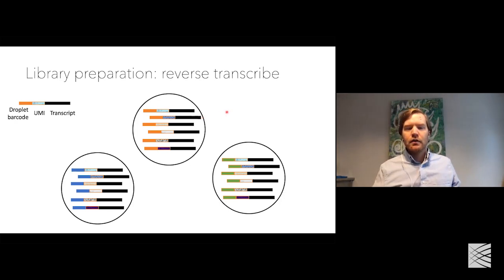And there's one more question. Thank you. It's also on this general theme. The question is, UMIs will by definition linearly increase with sequencing depth, so how much depth does it typically take to sample all the droplet barcodes, that is cells, within a typical 10K cell sample?